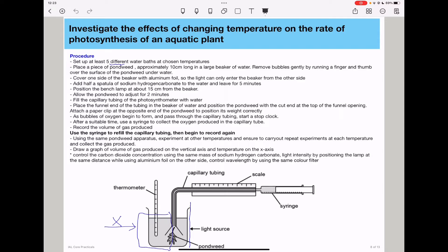You need to fill the capillary tubing of the photosynthometer with water. Then place the funnel end of the tubing in a beaker of water and position the pondweed with a cut end at the top of the funnel opening. Attach a paper clip at the opposite end of the pondweed to position its weight correctly. This ensures that the pondweed is in the right position and doesn't change position in the whole experiment.